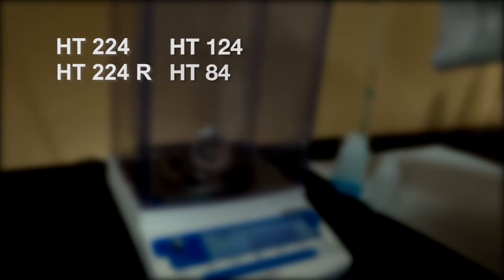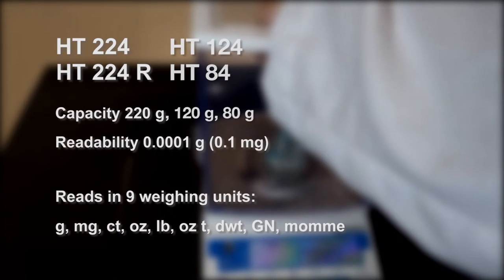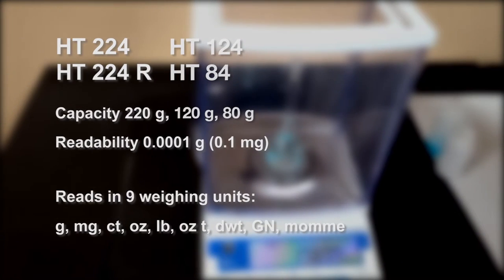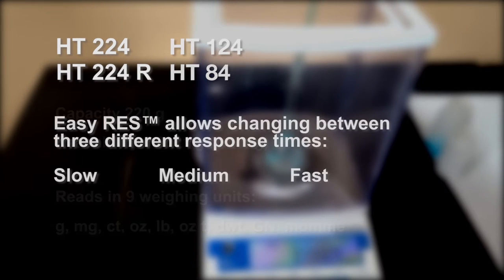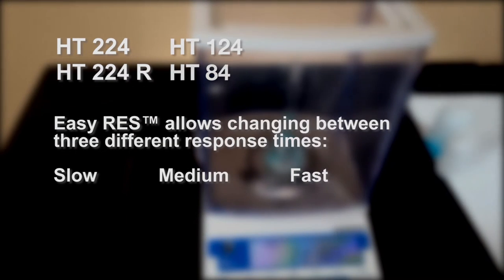The HT series provides analytical weighing at 0.1 milligrams and reads in 9 weighing units. EasyRes allows you to change between three response times to suit your application.